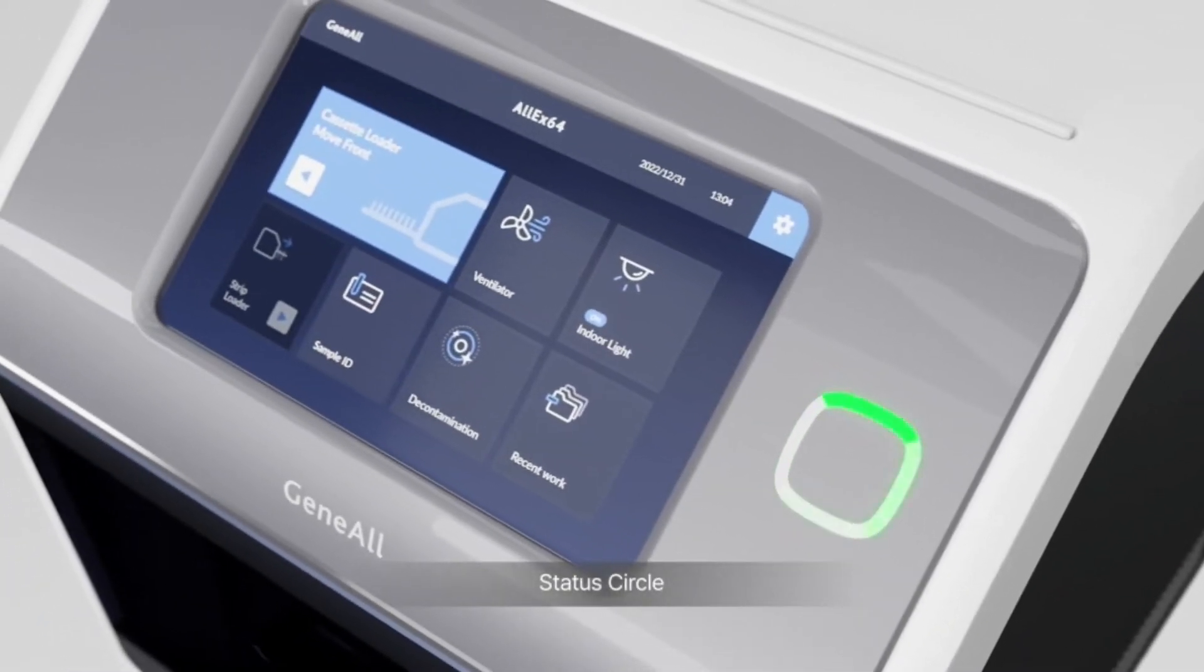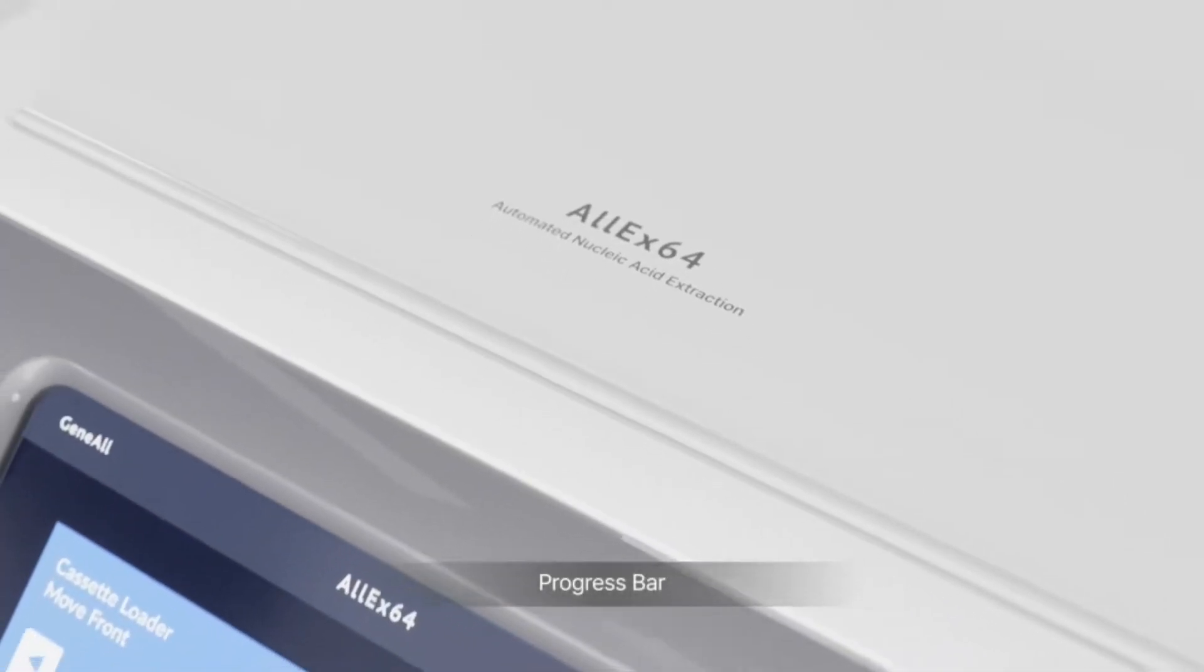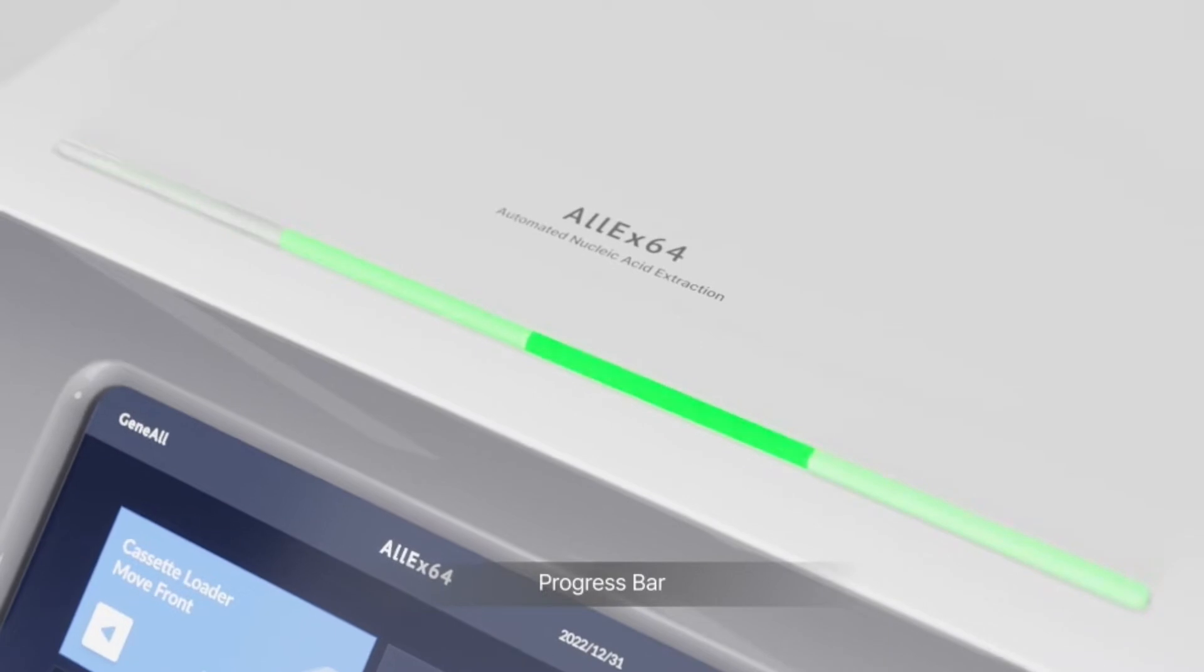The marked progress bar on the top provides an up-to-date overview of the current steps, increasing remote working capability.